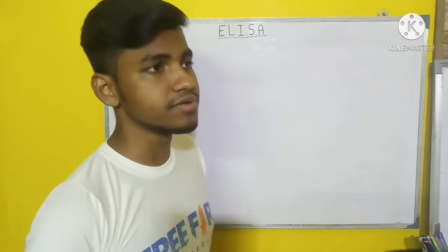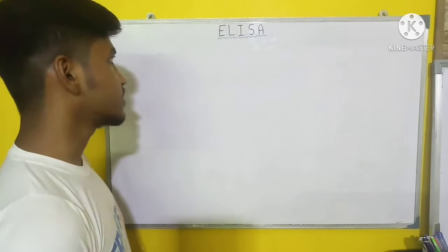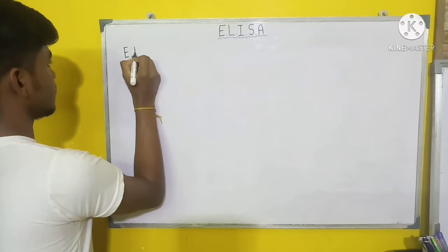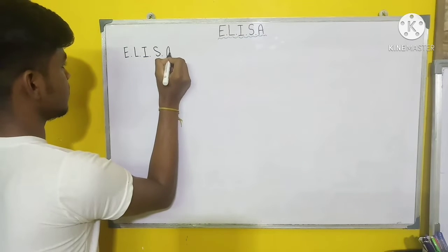The full form of ELISA is Enzyme Linked Immunosorbent Assay. So let's get started. What is ELISA?